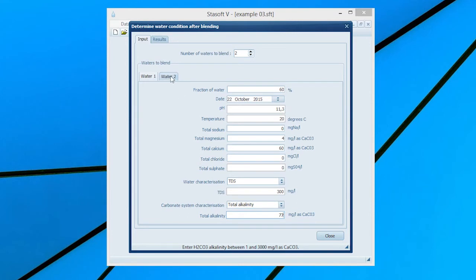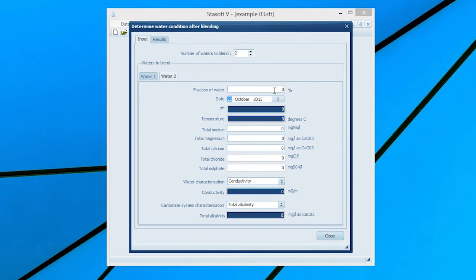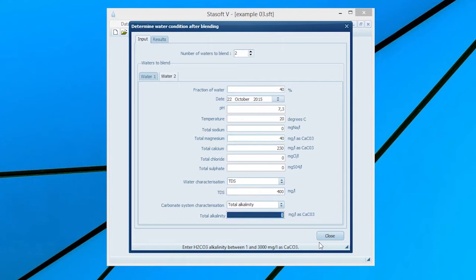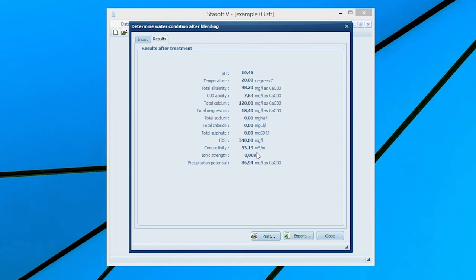After the data for Water 1 has been entered, select the Water 2 tab and enter the relevant data for Water 2. Selection of the Results menu option will bring the Results After Treatment window onto the screen with values for the final state of the blended water.